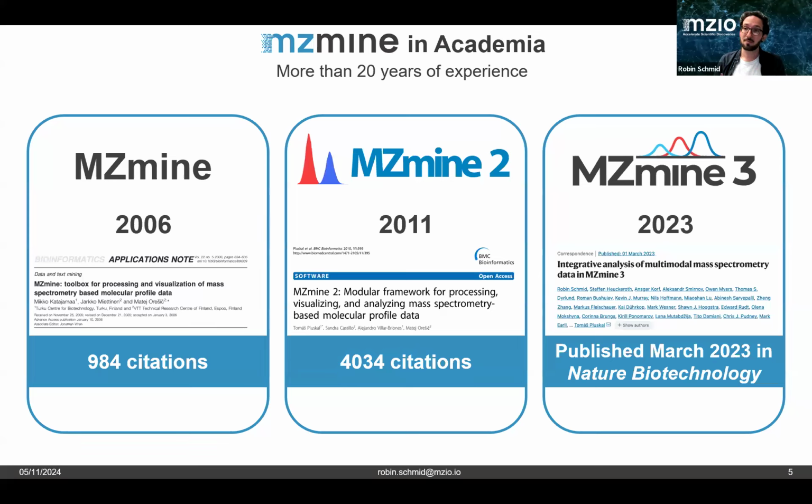And it all stems from a very long history in academia. In 2006 already, there was the first publication by the group of Matej Orisic. Later, Tomasz Pluskal took over the project, and he comes from computer engineering. He really took over the project and modularized it, modernized it, and put it on a good track.